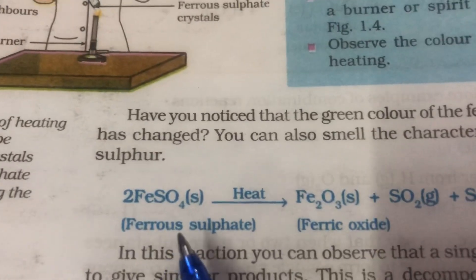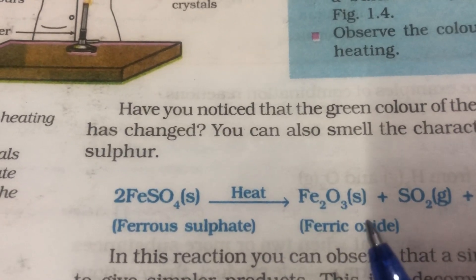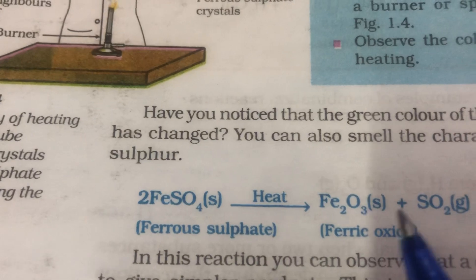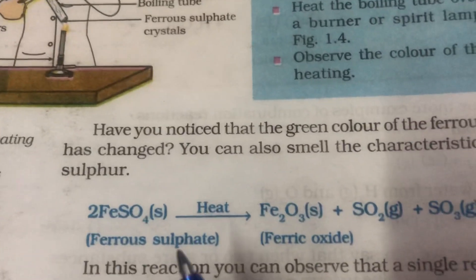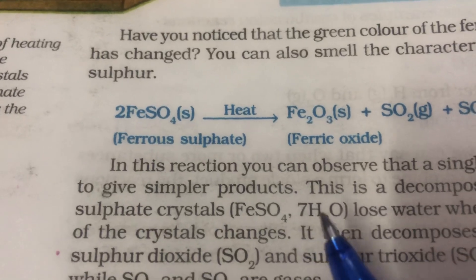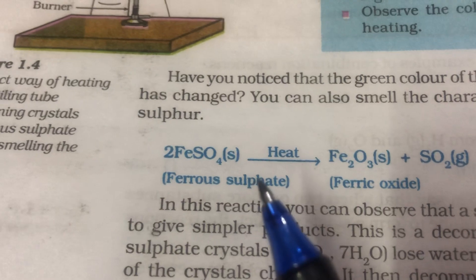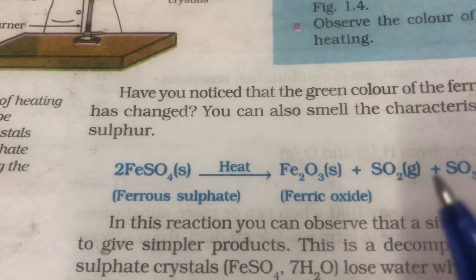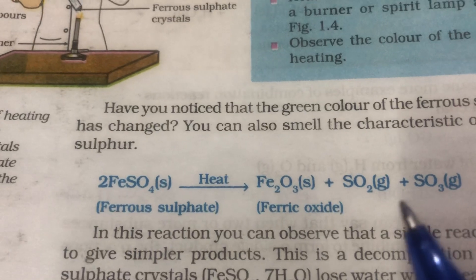As you can see in this equation, on heating ferrous sulphate, the product that you get is ferric oxide, and this ferric oxide is reddish brown in colour. So the final result of this activity is that the green coloured ferrous sulphate crystals first become colourless due to loss of water of crystallisation, and then the colourless crystals of ferrous sulphate change into reddish brown ferric oxide crystals. And two gases — SO₂ and SO₃ — are released, which have a smell of burning sulphur.